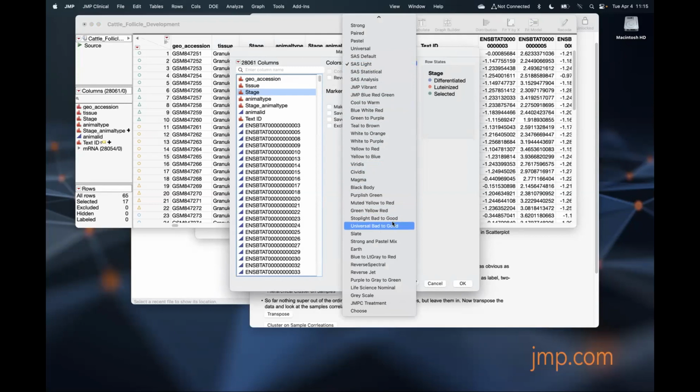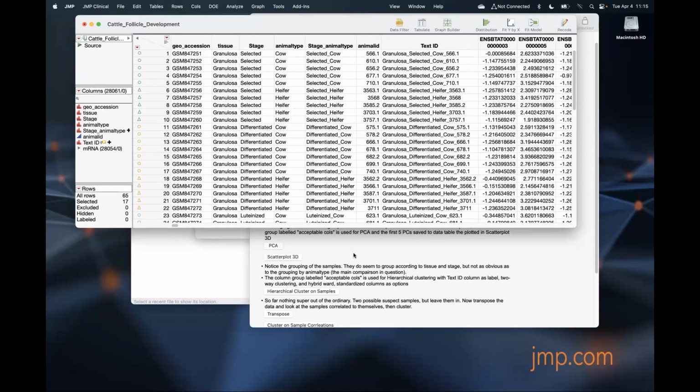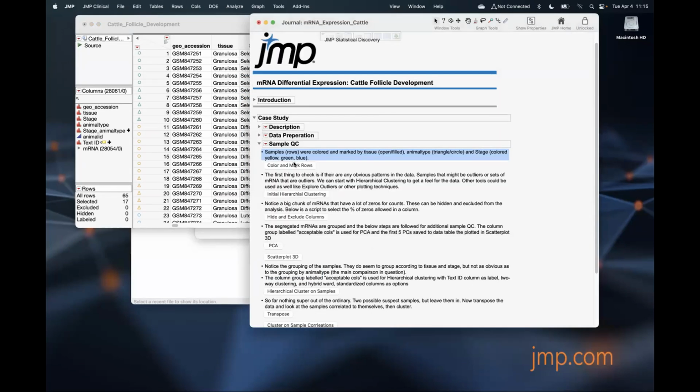And you have these options. Generally, this is kind of what I've done, depending on what combination and order I've done them, and you get choice. So that's how I did that. That's where I went to mark columns and color by them to get all these markers. I just saved that action into a single button.